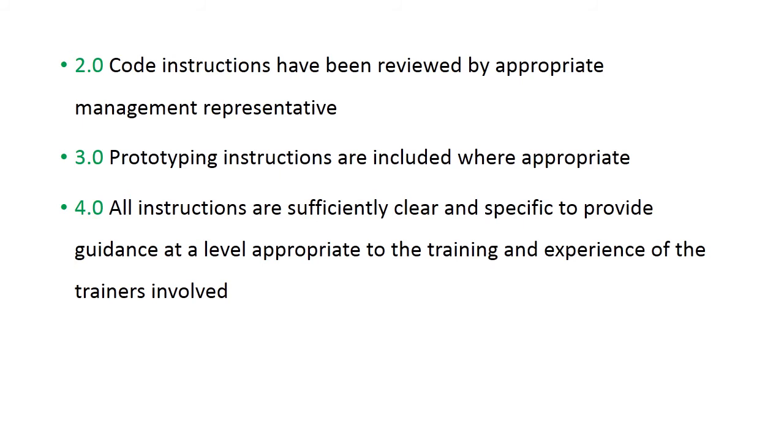All instructions are sufficiently clear and specific to provide guidance at a level appropriate to the training and experience of the trainers involved. Now this particular point suggests that the coder must be an experienced person, but suppose you are not finding a person with appropriate experience, then there is a need to provide training to develop LIMS software, to create codes for LIMS software, and during this training period there should be clear instructions.